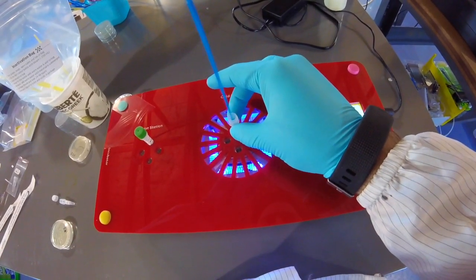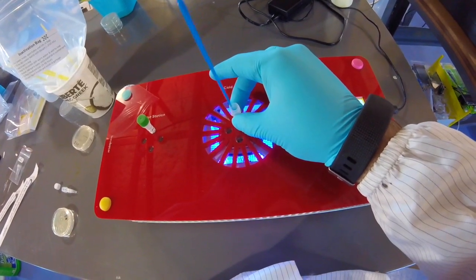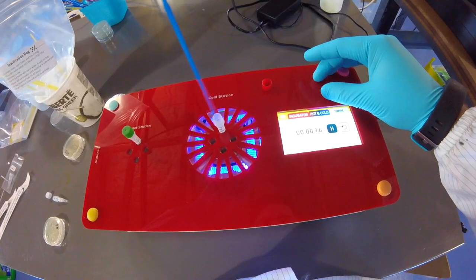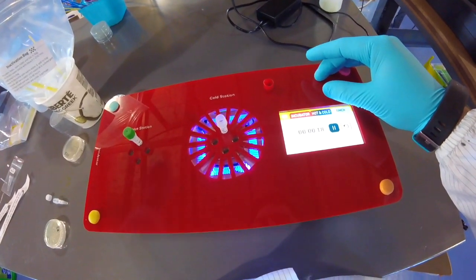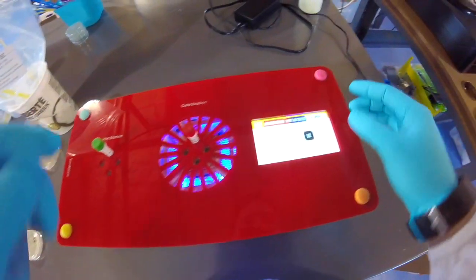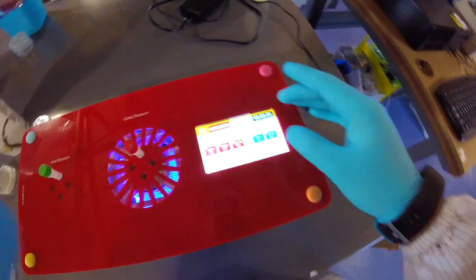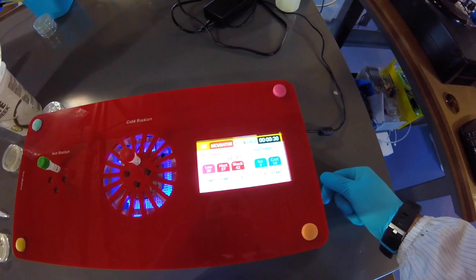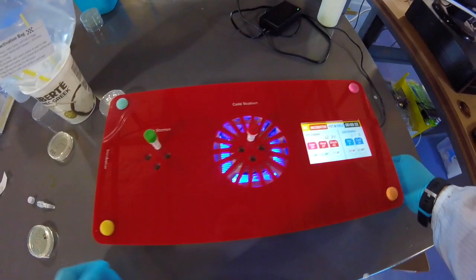It's a little flexible here. I would say between 5 and 10 minutes. But 5 minutes is good. There we go. Put that in the discard container. I'm just going to set the lid back on and let this stay cool. You can see the hot station is almost down to 42 now, so it should be in a good spot for when we do the heat shock, which is the next step.